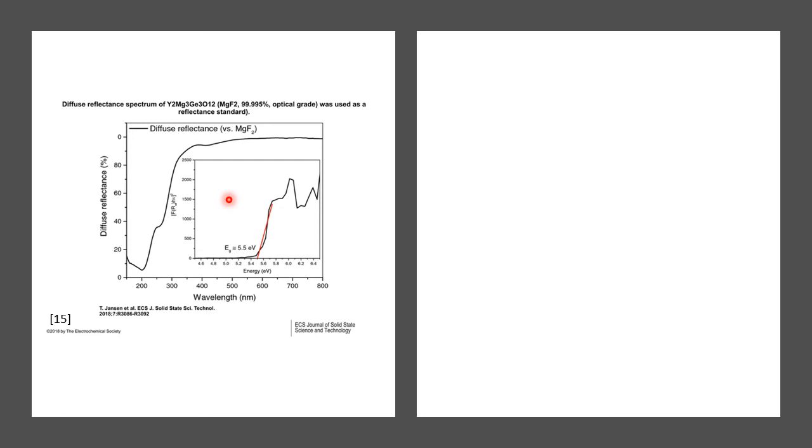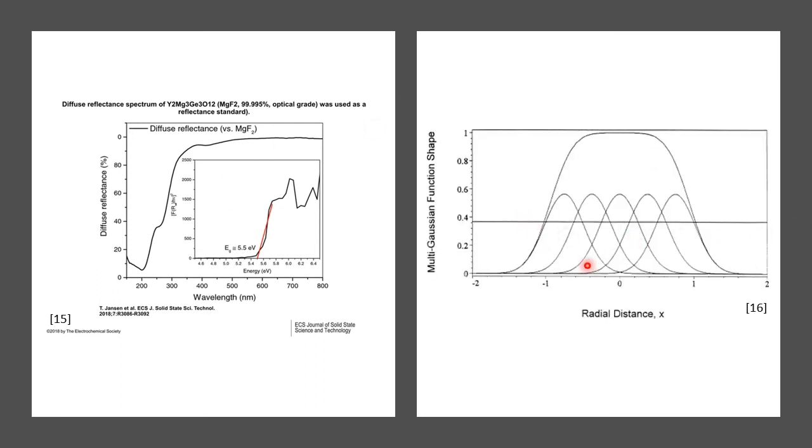Looking at this graph, it's almost flat. In reality, it isn't an infinite number of infinitely thin peaks, but a sum of approximate Gaussians. So if you think of it, it's more the sum of the reflectance spectra of its constituents. So it would be more like this, but obviously it would be nowhere near as uniform. So this is why it's very difficult to get a flat spectrum, which is what you would be striving for if you wanted a perfect white reflectance standard.